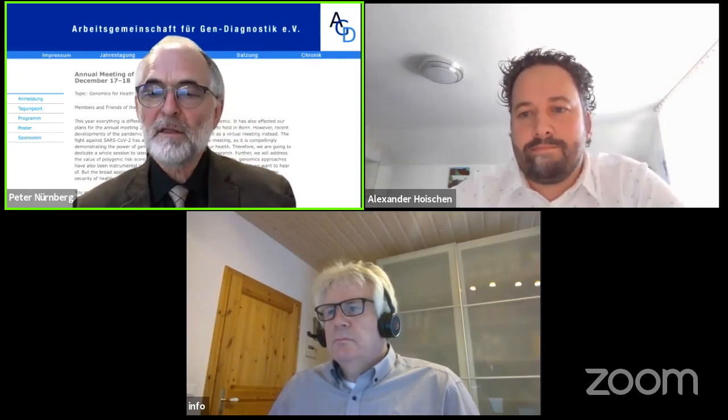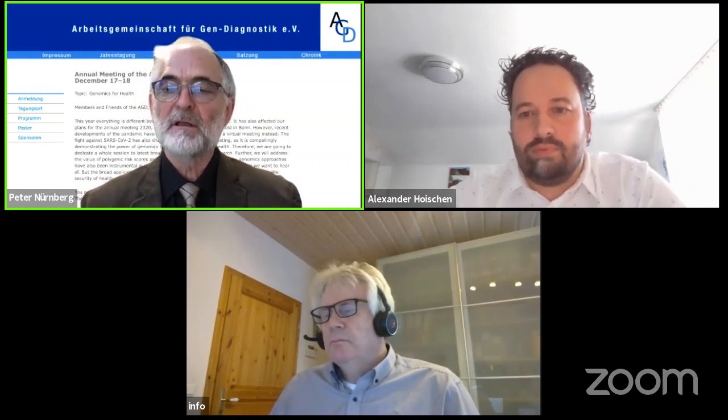Okay, there is another question from Hartmut Engels. He asked, have you also analyzed translocations with breakpoints in larger segdups, such as the common t(11;22) translocation? Yeah, I think, hey, Hartmut, great to see you, or at least hear your question. That particular one, I don't think we've done. But yes, we've looked into that both in cancer, but also in constitutional aberrations.